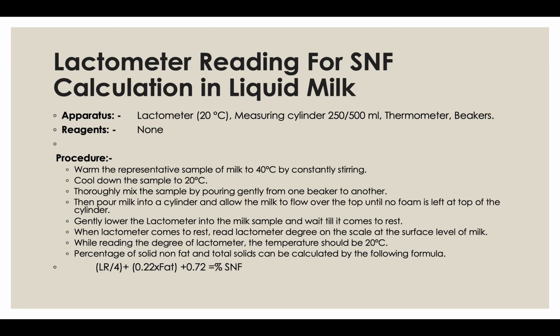Gently lower the lactometer into the milk sample and wait till it comes to rest. When the lactometer comes to rest, read the lactometer degree on the scale at the surface level of the milk. While reading the degree of lactometer, the temperature should be 20 degrees centigrade.